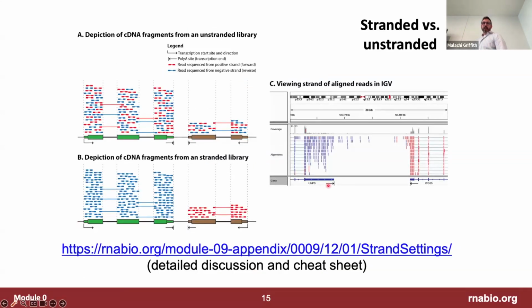Okay. And then we'll talk a little bit about stranded versus unstranded data. Most of the example data for the exercises and tutorials is stranded, but there continues to be this mix where you do or don't know the strand information. We'll introduce you to a tool that will let you figure out whether and how your data is stranded.